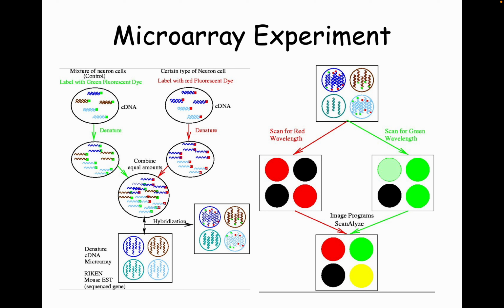This is very much like what's going on inside the machines that are doing next-gen sequencing. Of course, right? Yeah, like those Illumina machines where they take a picture of a spot and they tell which color the spot is, exactly like this.